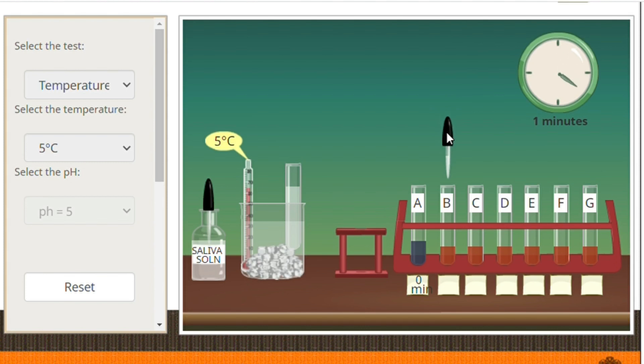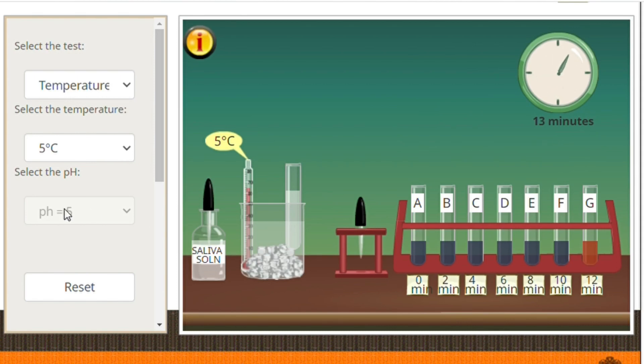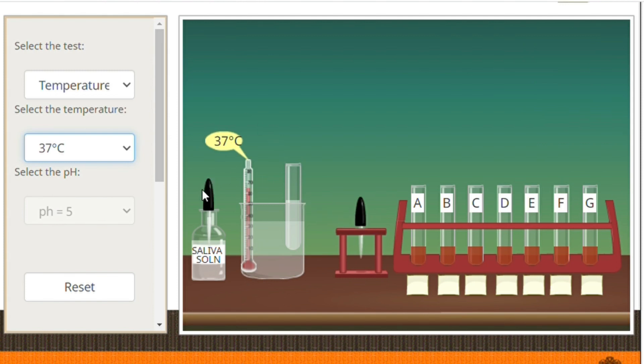After an interval of 2 minutes, take a few drops again from our mixture and add to the next iodine tube. Note the color changes. We will keep on adding after every 2 minutes until the color of the iodine does not change. For the temperatures 37 degrees Celsius and 70 degrees Celsius, we will just be repeating the steps that we did at 5 degrees Celsius.